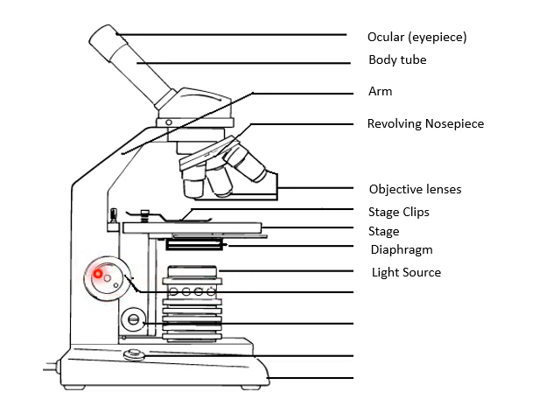Now, this big knob on the side here is the coarse adjustment knob. So we're going to use the coarse adjustment knob. We put this slide under, we start with low power, we're going to start the lowest, and then we can really quickly focus the specimen. So we can just kind of get it into view quickly. We're not sitting there for hours trying to twirl around and be all finicky. So the coarse adjustment knob quickly brings the specimen into view.